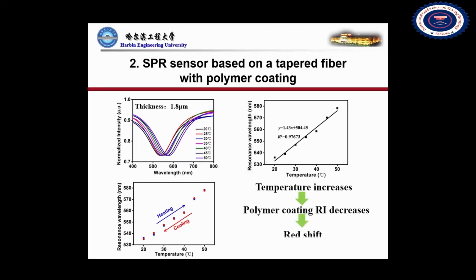As a kind of polymer material, the optical properties of the photopolymer also respond to temperature. Therefore, we test the temperature response of the sensor by changing the temperature in the range of 20 Celsius to 50 Celsius, and the interval is 5 Celsius degrees.